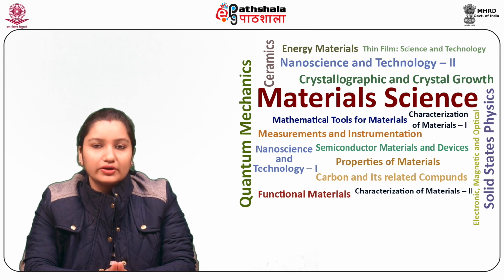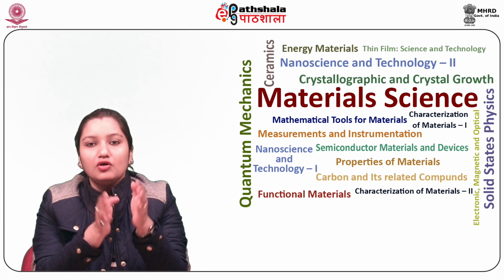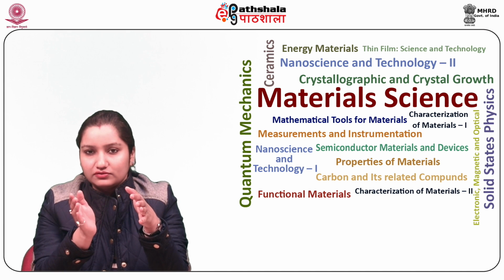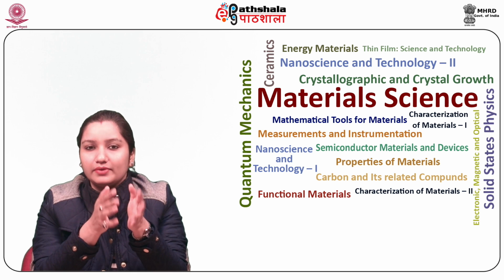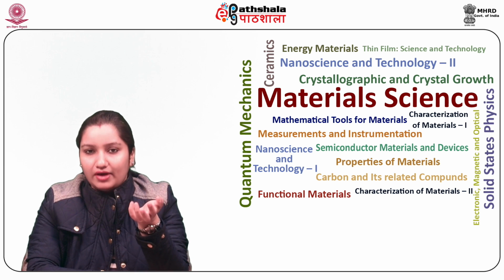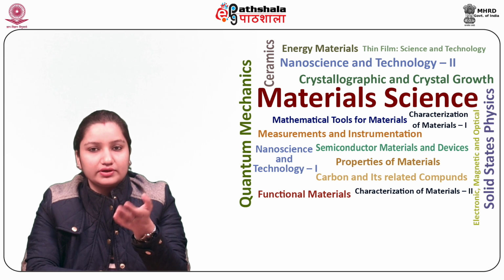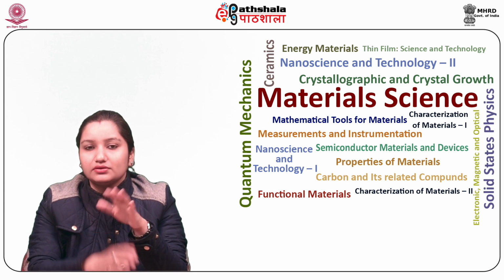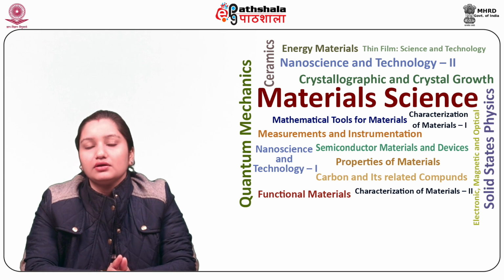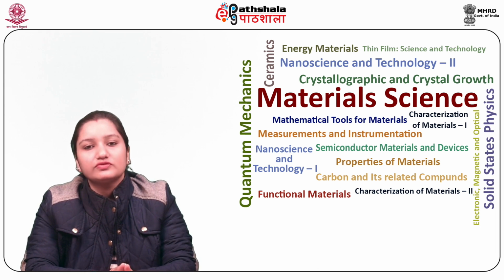Fourier transform infrared spectroscopy or FTIR spectroscopy is meant to overcome the difficulties experienced in dispersive instruments. An important limitation was the long time required for the scanning process. It is desirable to simultaneously measure all IR frequencies. So the solution used is a simple optical device called an interferometer to produce a signal composed of all infrared frequencies embedded within it. The signal is recorded very rapidly, typically within a few seconds. Therefore, measurement time per sample was abridged to a few seconds.